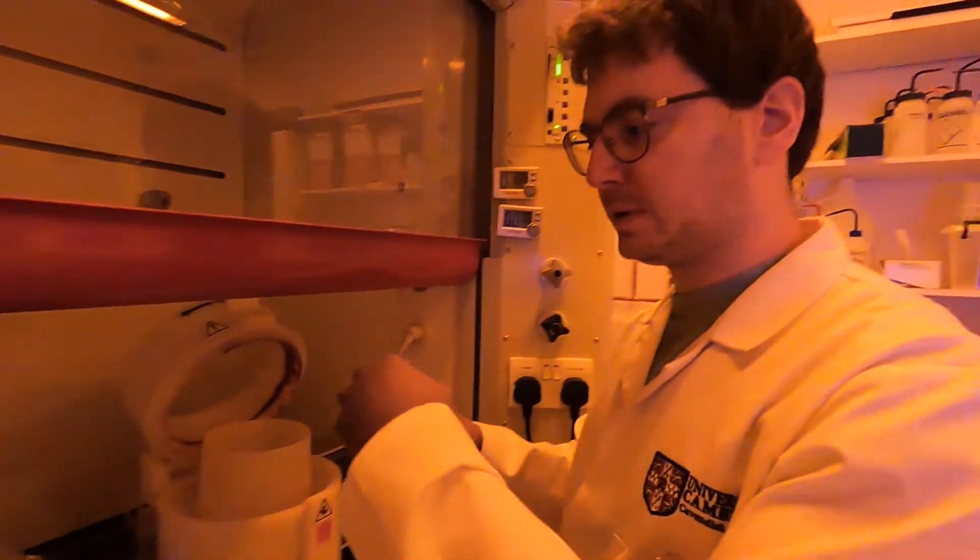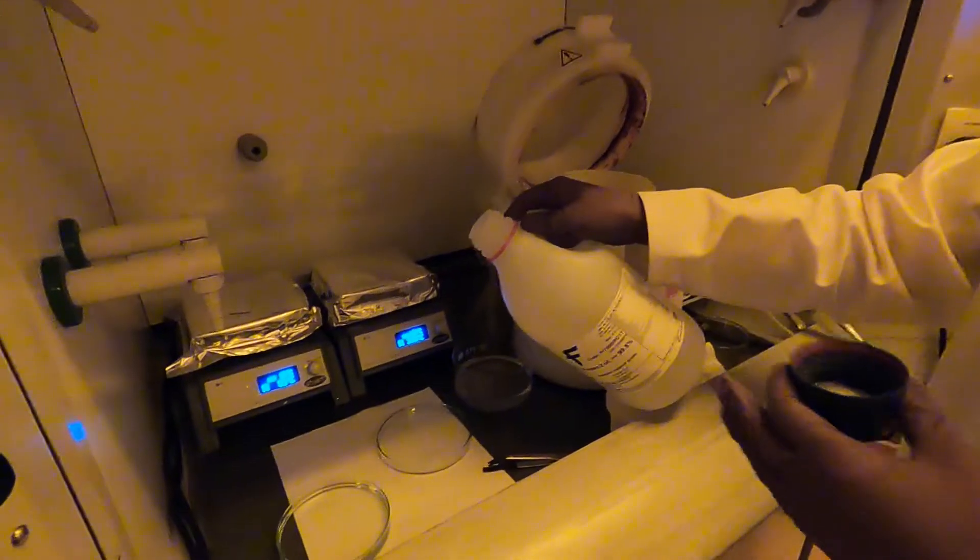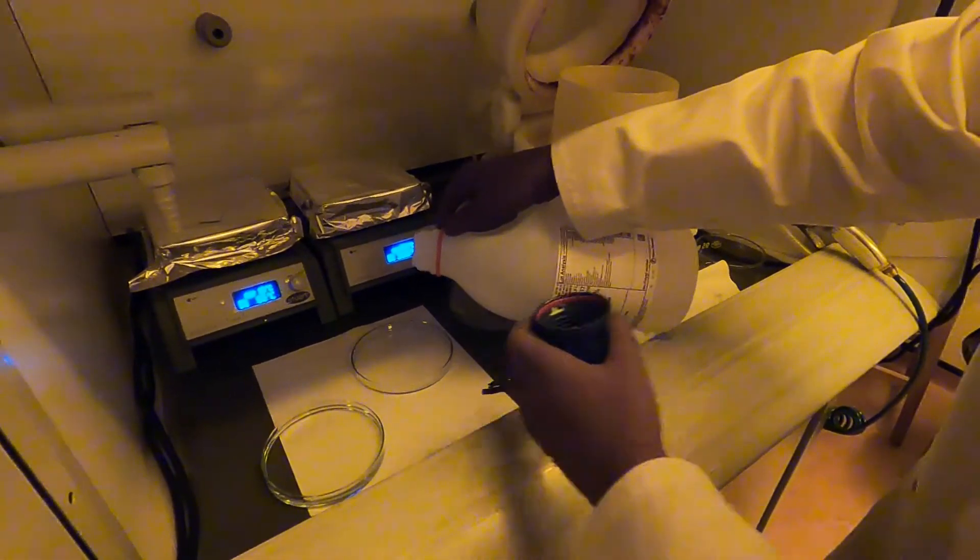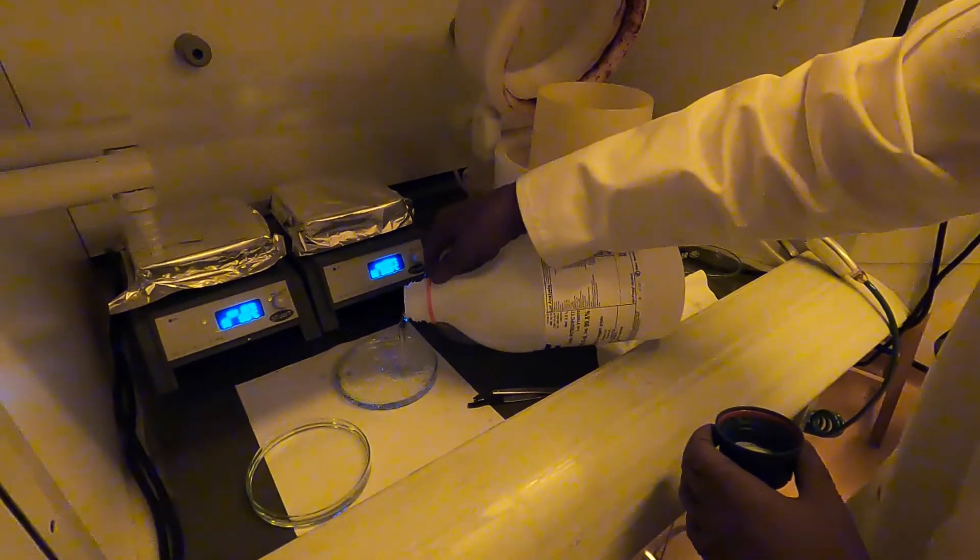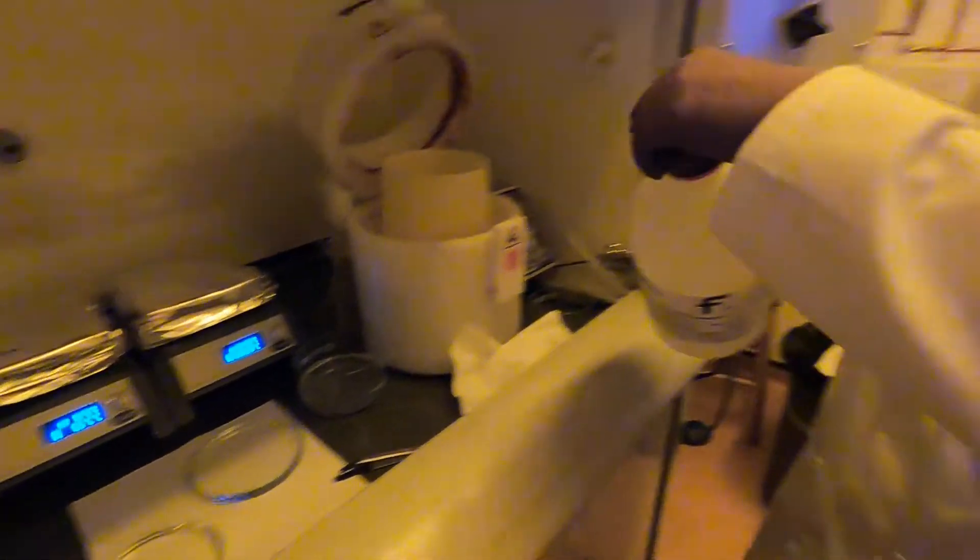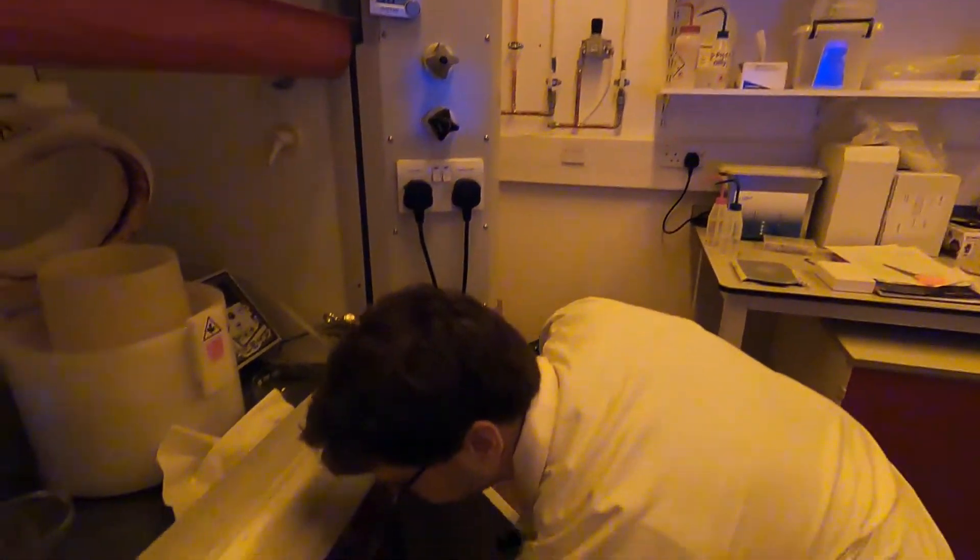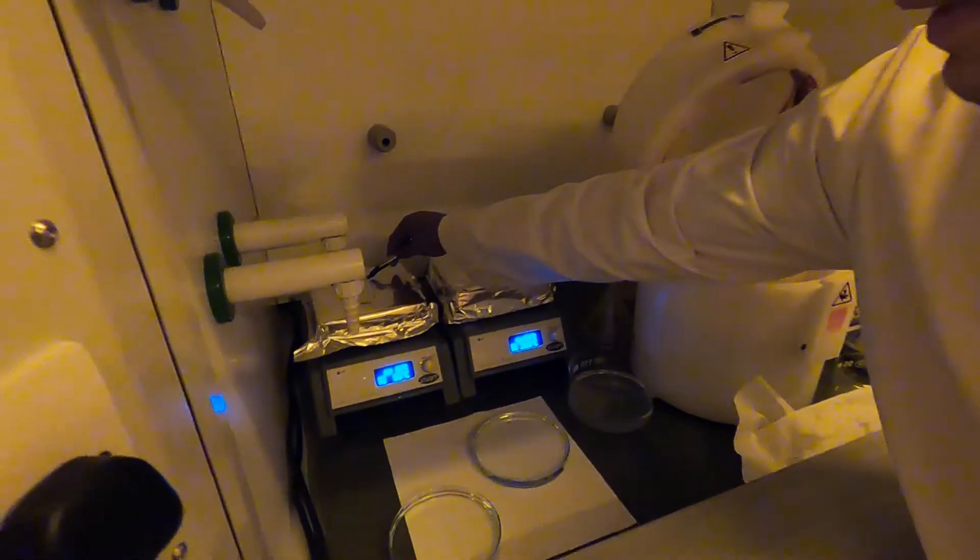In the second half of the petri dish, I'm going to put isopropanol. The isopropanol is used to interrupt the development. The PGMEA will do the actual development and remove the unexposed SU-8. Then we will transfer the sample into the isopropanol to stop the development and check that we have developed correctly. I'm now going to take the sample off the hot plate.